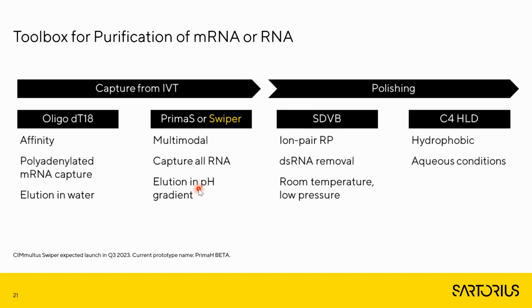And in the remainder of my time with you today, I would like to tell you a few snippets of our work in then purifying the mRNA out of the IVT mixture. We're chromatographers, so we believe in the power of chromatography to produce pure RNA, pure and stable RNA, I should say, in a scalable fashion.